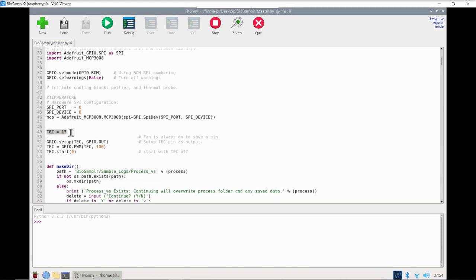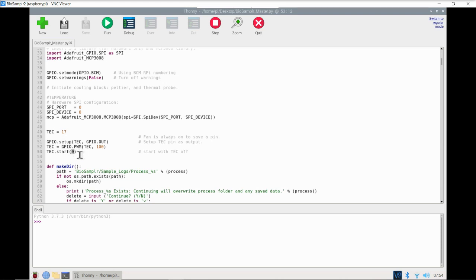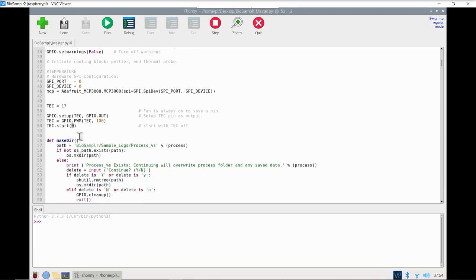We will define our first GPIO pin here. GPIO is general-purpose input-output pin. We need to tell the Pi each pin that we're using to either send a signal to something or receive a signal from something. We're going to set up our Peltier, our thermoelectric cooler, on pin 17, and start that Peltier module with a duty cycle of zero, so that is off to begin with.